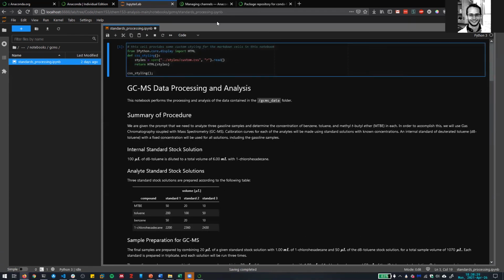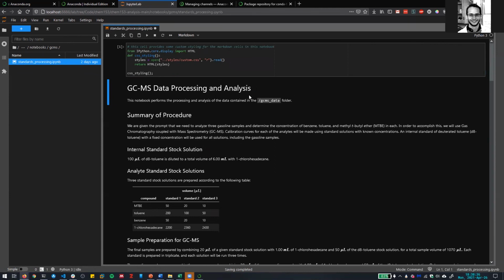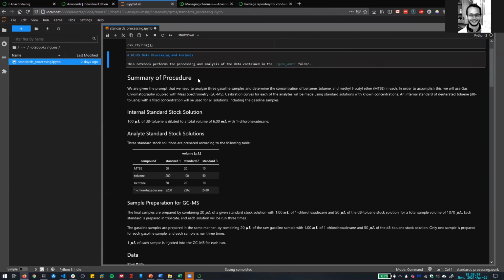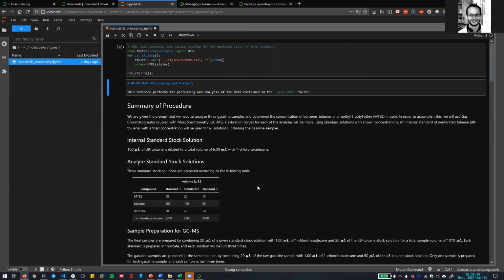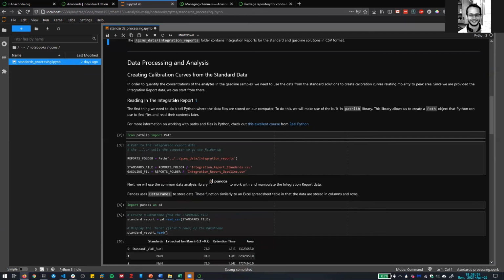I haven't run this in this environment yet, so I might run into the same issues. And most of this stuff is what's called Markdown. So if you double click on these cells, you can include styles and writing within Jupyter notebooks, which makes it easy to explain things. So that's what I did here, which has a lot of this text and whatnot. But the actual code files are these things.